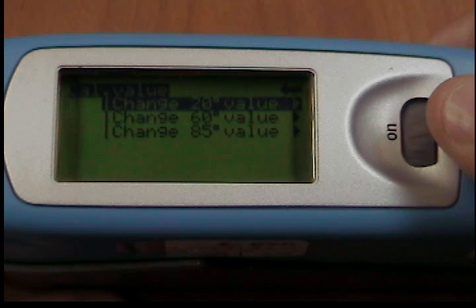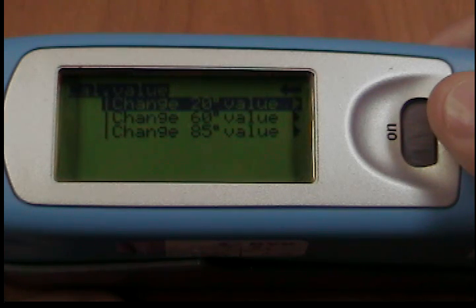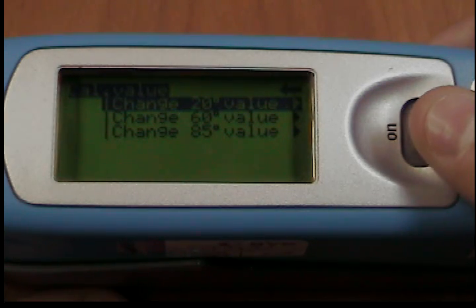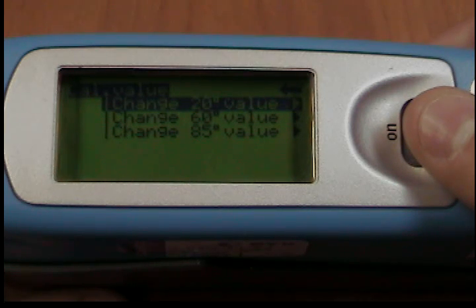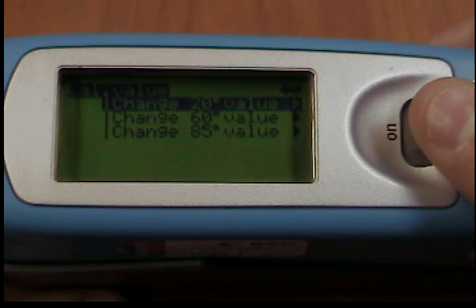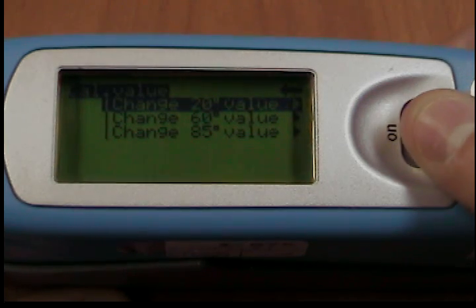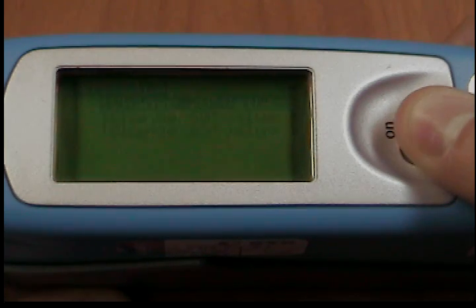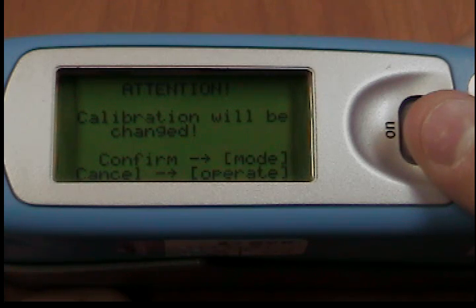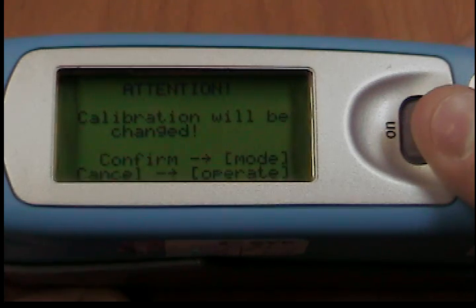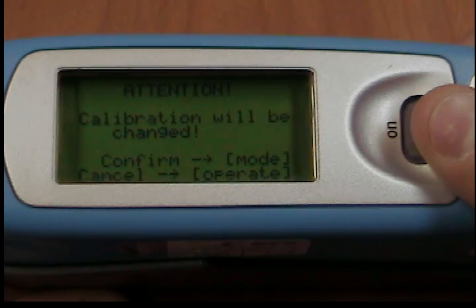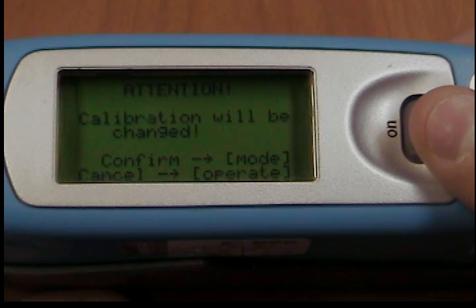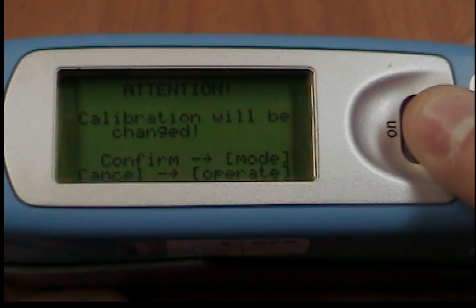You can use the path shown on the right side to reach the Change Calibration Values menu option: Main menu > Calibration > Change Calibration Values. In some cases, a selection menu may appear for geometries. Select the desired geometry and press the scroll wheel. A warning message appears. You can cancel this process by pressing the Operate button. If you press the scroll wheel, you will continue with the process of changing calibration values.